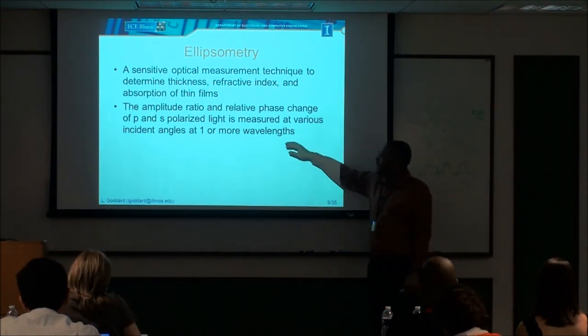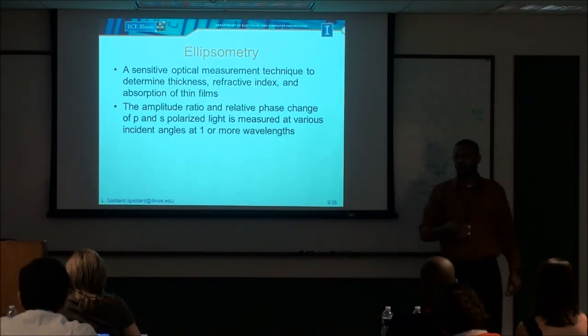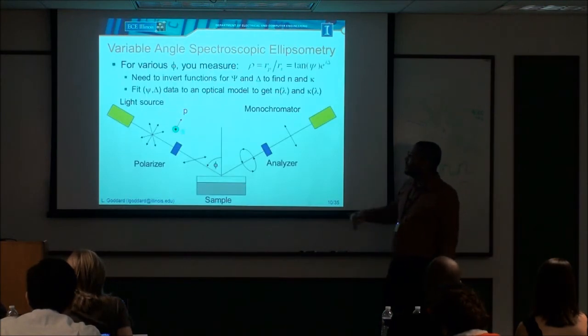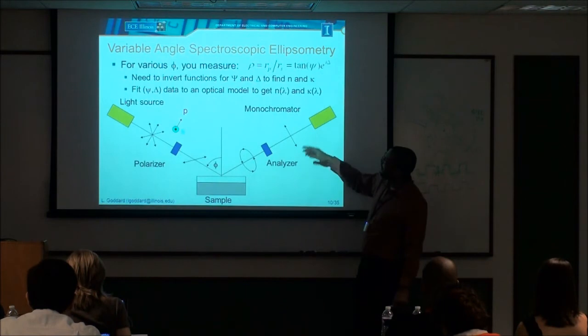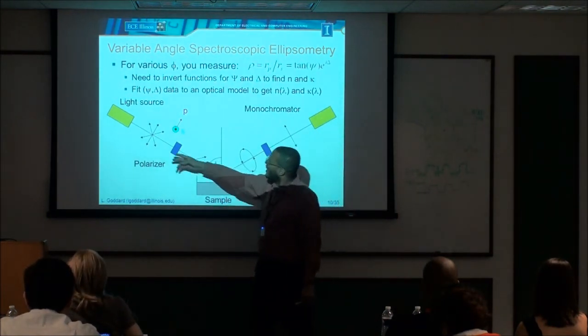The way that it's done is that you measure a polarization. You measure the reflection for two different polarizations and compute that ratio at various incident angles. So a picture, wow, all my colors are off, and these were different colors in my slide.